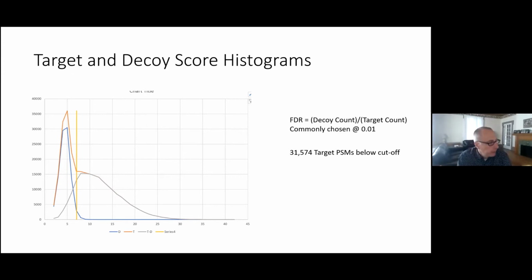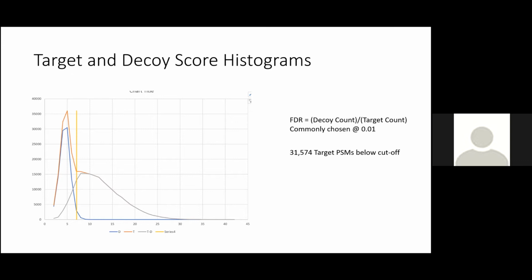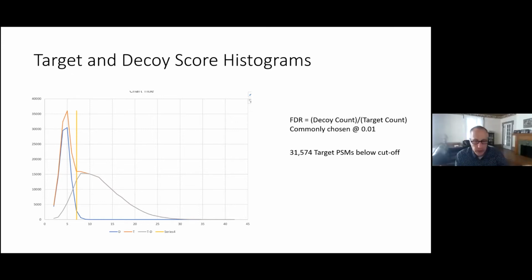Okay. So what do you recommend? To just go with either approach? Oh, I've been wondering this in my head lately, if PSMs have any value at all. In our lab we basically never use PSMs as a quantitative measure of abundance. I think it can work okay for medium and higher level abundance, but at low level, PSMs are a really noisy count.